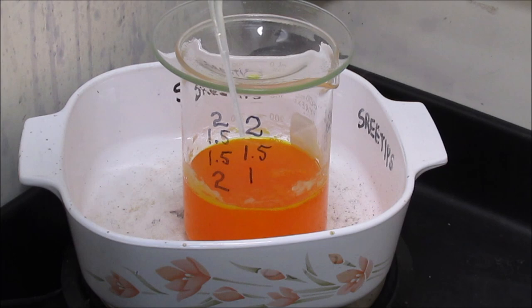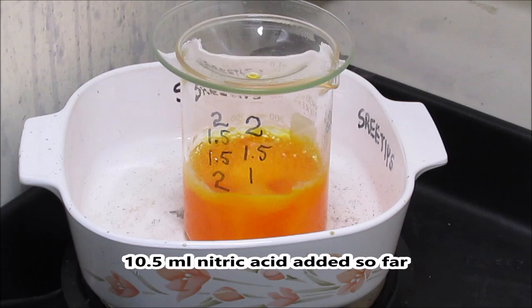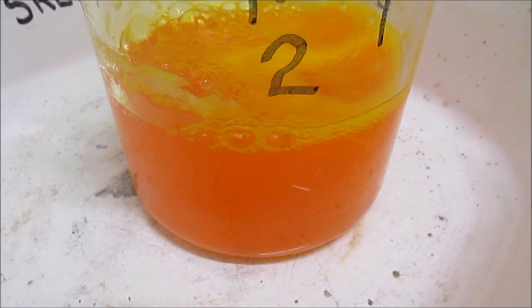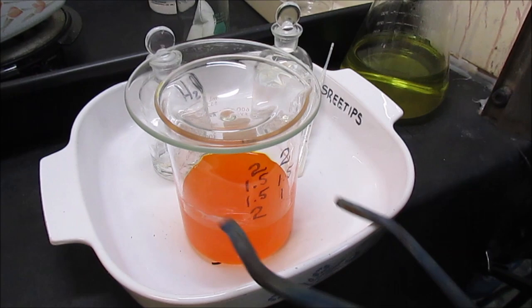I've got just a little bit of gold left down at the bottom of the beaker here. I'm going to put another 0.5 ml in. Everything's gone into solution now, about 40 minutes. We'll take this down off the heat, let it cool off, and then we'll filter it out and precipitate out the pure gold.